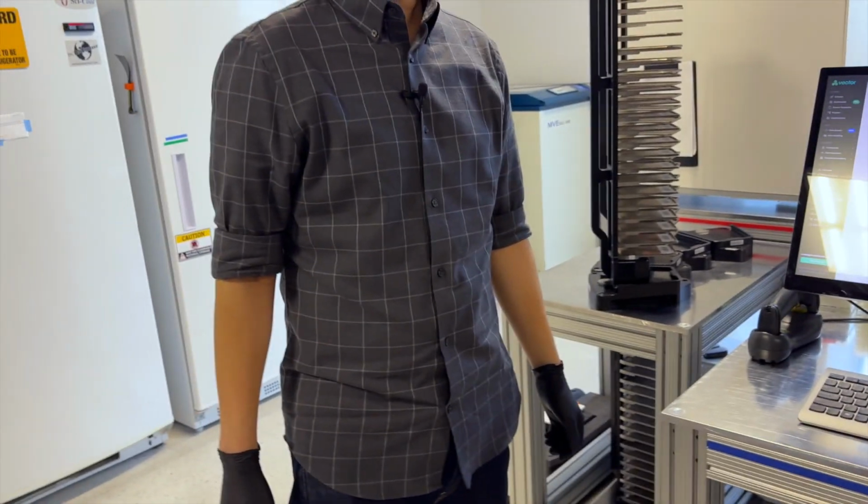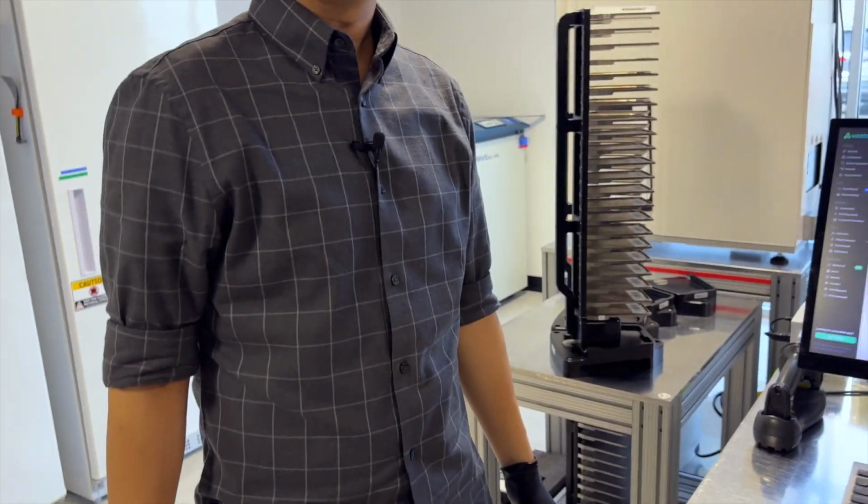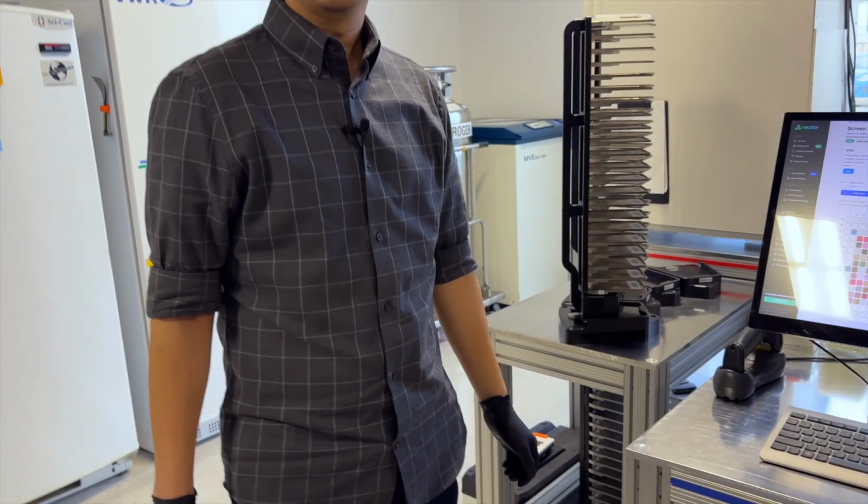I'm curious what the learning curve is for scientists as they come into the lab and they're trying to interact with this LIMS. How do you manage that? Yeah, I will say this is one of the benefits of building in-house, and a callback on how important empathy is. Your coworkers, your users or customers, they're right there. It's your scientists. So, when you bring in a new person, you teach them a little bit about how to use the LIMS, you watch them, you strongly encourage them to come to you with any questions, feedback, and you get a sense for what works and what doesn't.